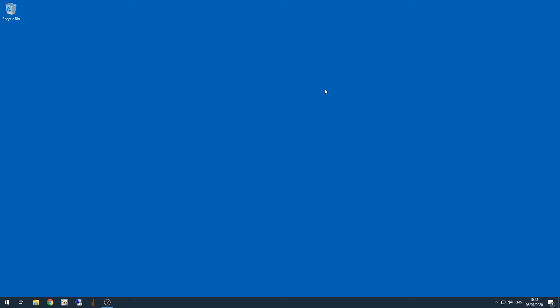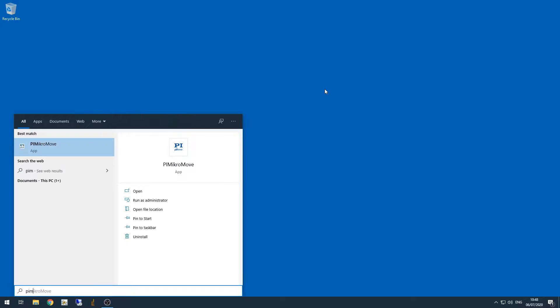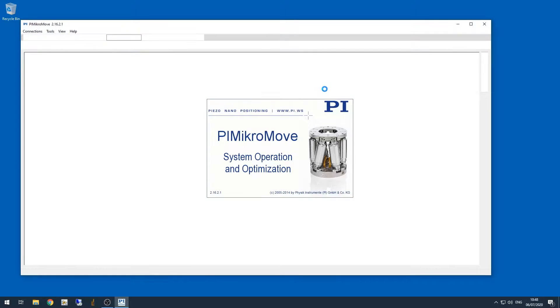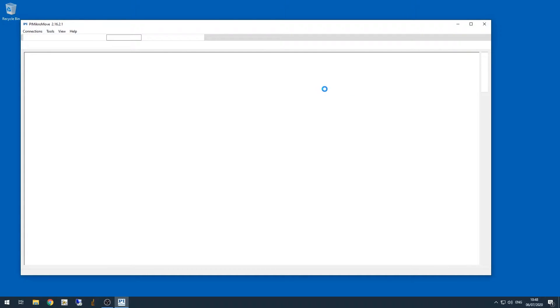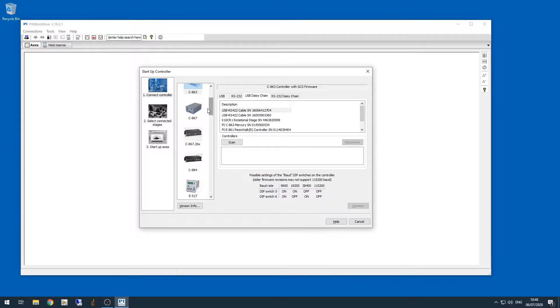So let's open up PI MicroMove. When you open PI MicroMove, you immediately get a window popping up that asks what controller you want to connect with, and we need to connect with each controller individually to make sure they're working okay.